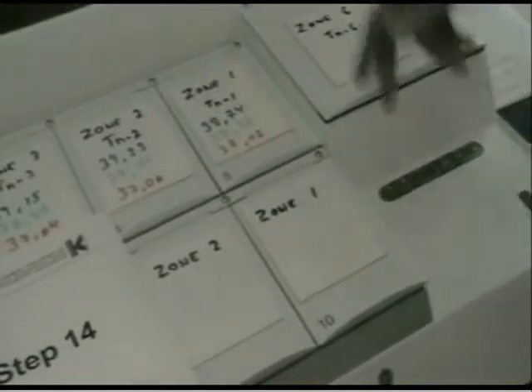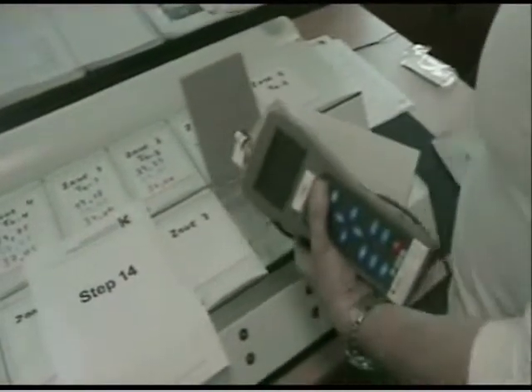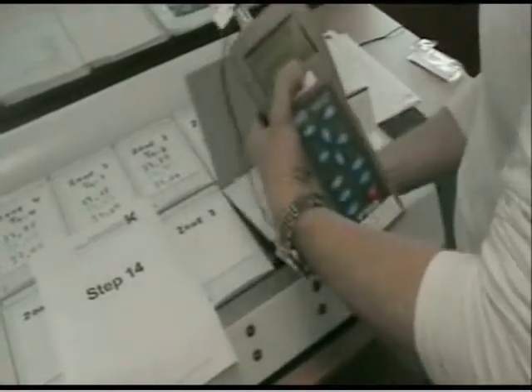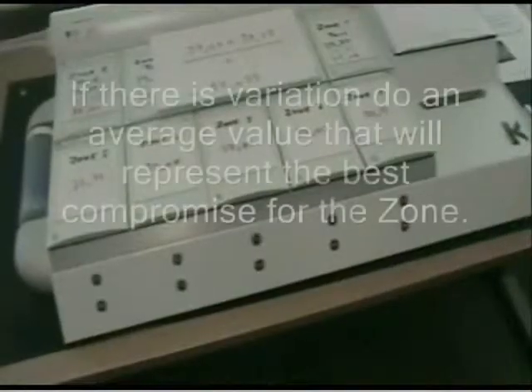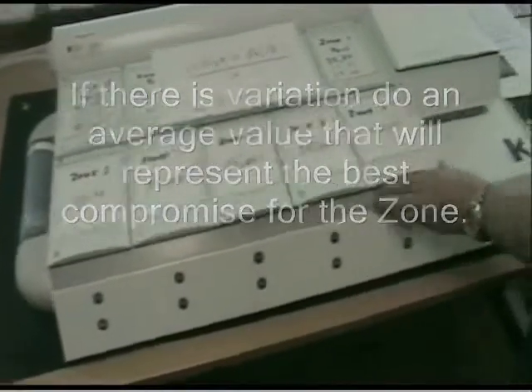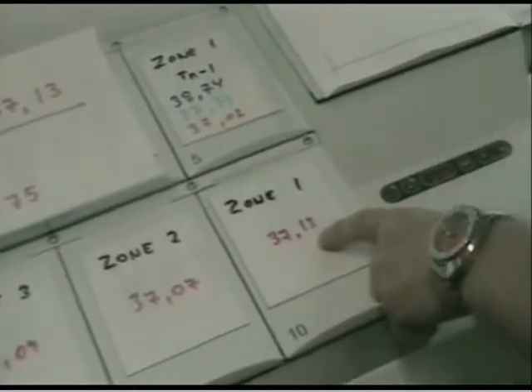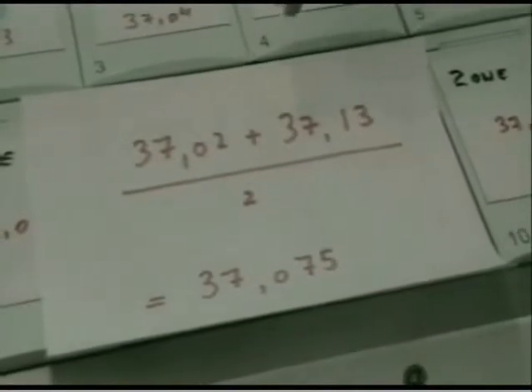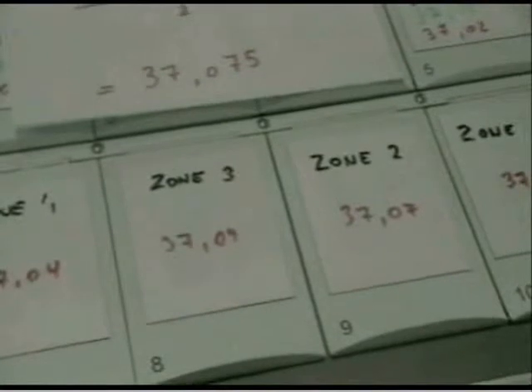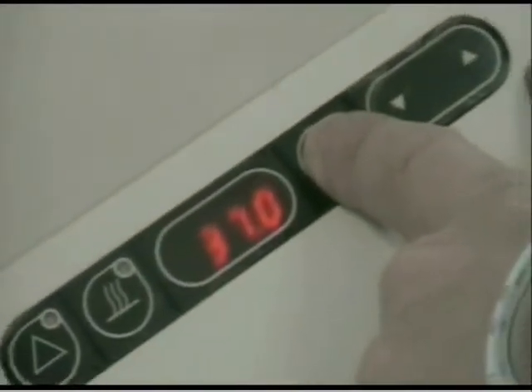Within one zone, we need to make sure that the upper and lower compartments are at about the same temperature. We do measurements in the lower compartments. Zone 1 shows 37.13 in compartment 10. Since we cannot adjust temperature individually inside one zone, we average: compartment 5 is 37.02 and compartment 10 is 37.13, giving an average of 37.075. We go into the menu and adjust tune 1 to 37.1 to get the best average for that zone.